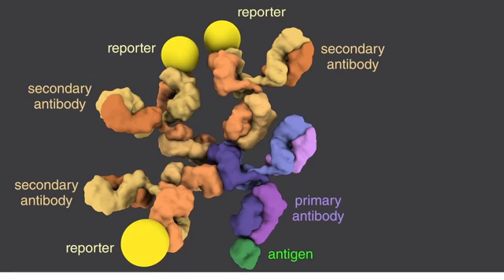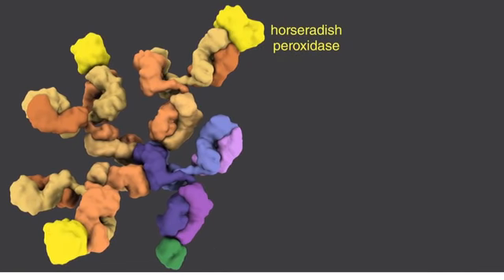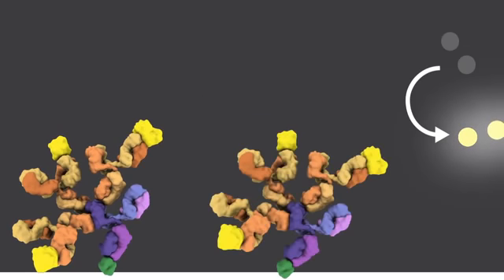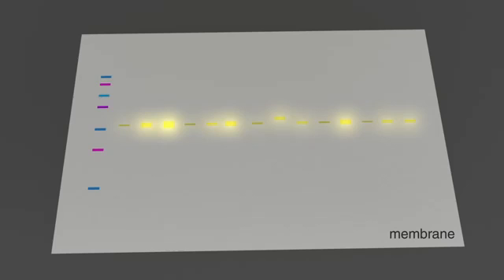The most commonly used secondary antibody type for Western blotting is conjugated to the enzyme horseradish peroxidase. Horseradish peroxidase catalyzes a reaction that produces light as a byproduct. The amount of light produced is directly proportional to the amount of horseradish peroxidase conjugated antibody bound. The light signal is a transient product and will only persist while the reaction is occurring.